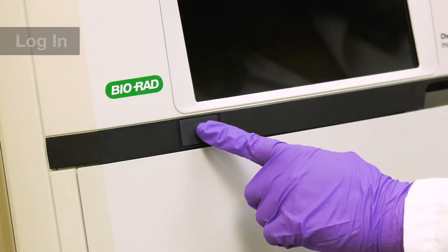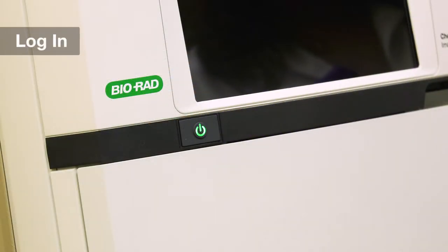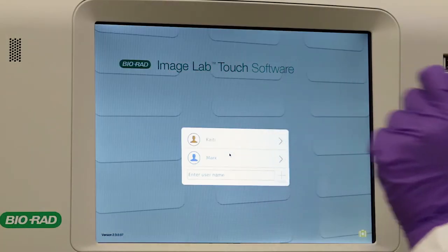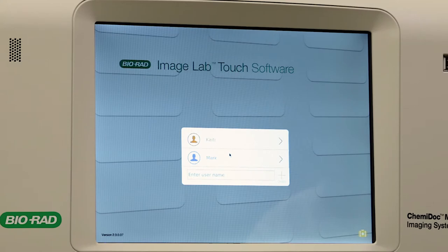To turn on your Chemidoc, simply push the green button in front of your instrument. When the customizable home screen appears, tap anywhere and your login menu will appear.